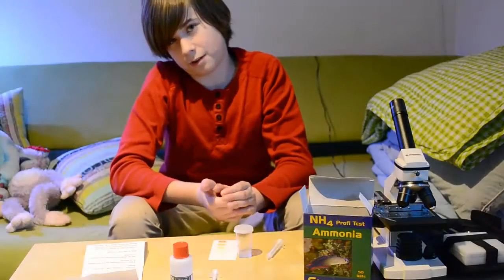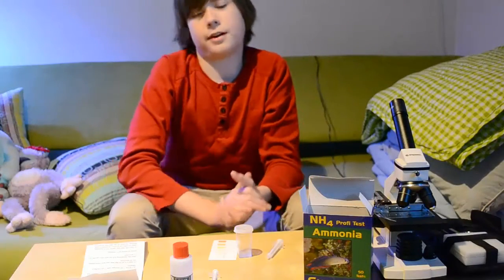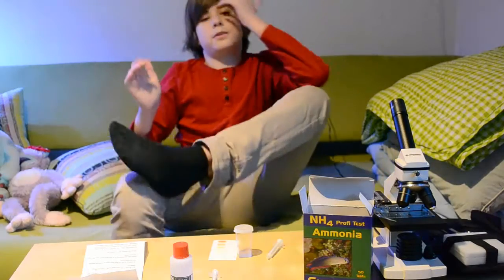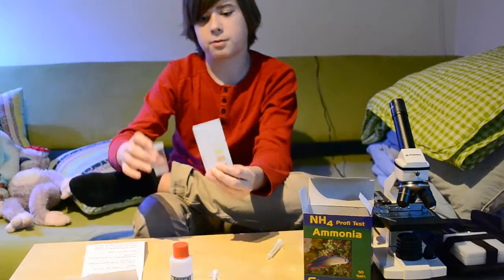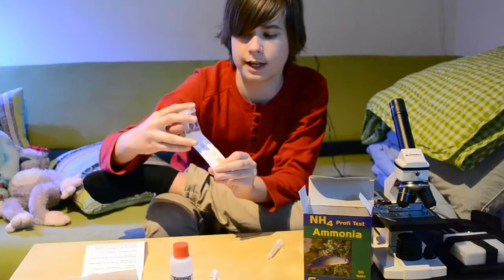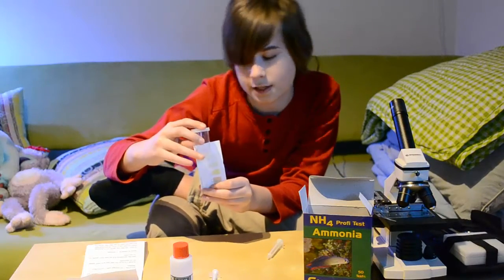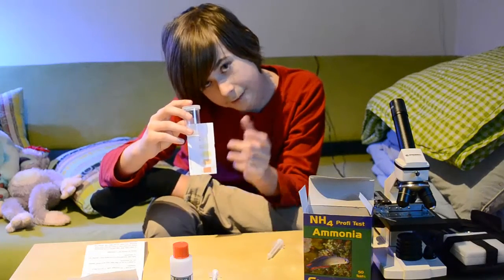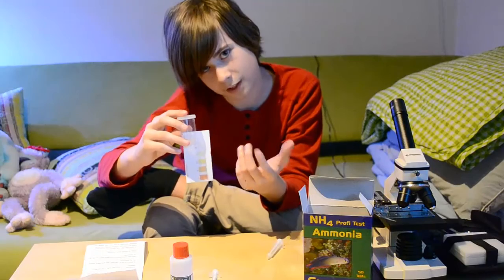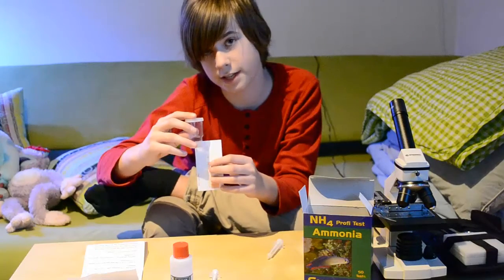It says to wait about 3 minutes, but I've found that 2 minutes is actually enough — though you can wait 3 minutes if you want to be completely sure. Then you hold the test bottle up like this, and as far as I can see, it is at 0.25. My ammonia has always been like this, but my nitrates are pretty high, so the cycle is happening fast.